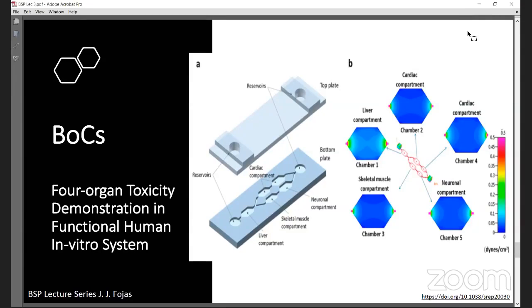In this work, the authors report a functional human model to evaluate your multi-organ toxicity in a 4-organ system under continuous flow conditions in a serum-free defined medium utilizing a platform for 14 days. So this one is the 14-day study. But still remember this. This is, I think, the last paper that I read last week.